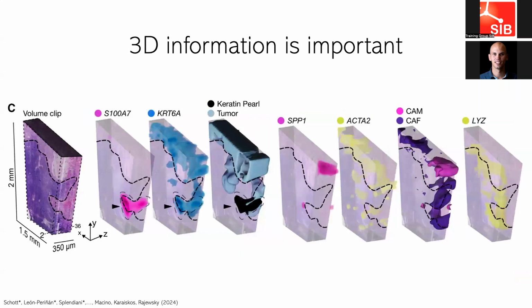They give one example on cancer, which I know nothing about, but what they try to explain here is that if you take one 2D section, there might be a structure over here that you say is too far away from here, for example. While in 3D, these two things might be connected, because you have to look at a different depth to link these two features that in one two-dimensional image are too far away.